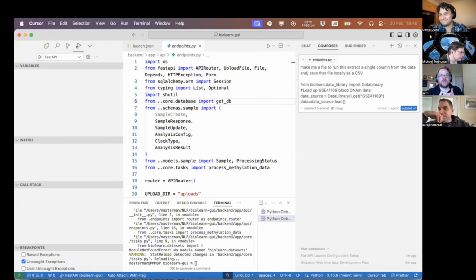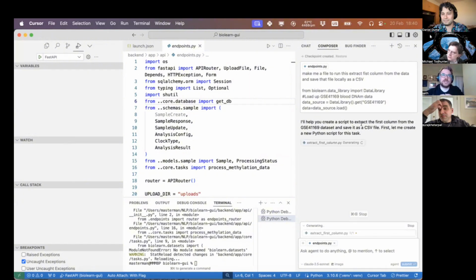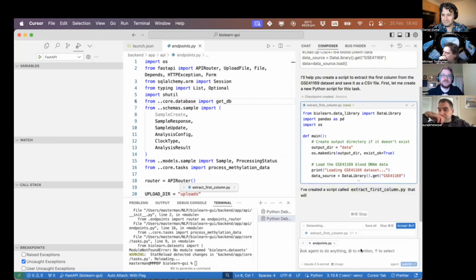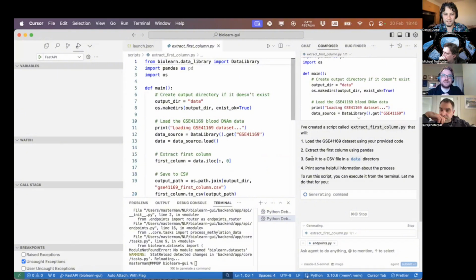Okay. Each column is a sample, and we just want one sample, right? So we wanted one sample. Okay, first one, yeah. Sure. Okay. But also, data is not a data frame. It has data frames on it. It's an object. Okay. So we need to take data.dnam, DNAM. Okay. Well, let's go with this first. So I have a file. Cool.